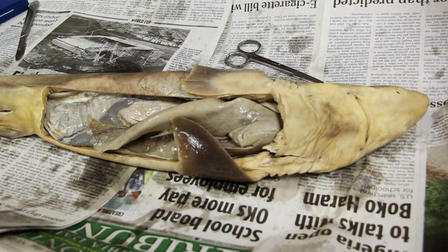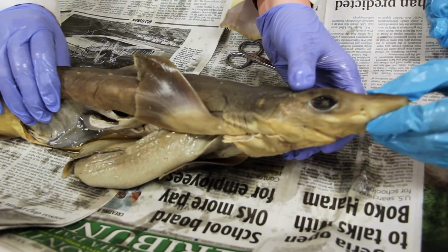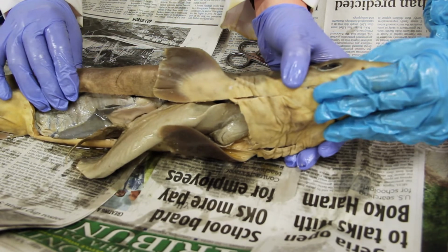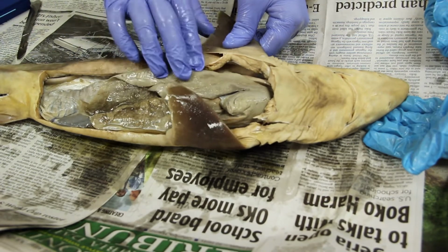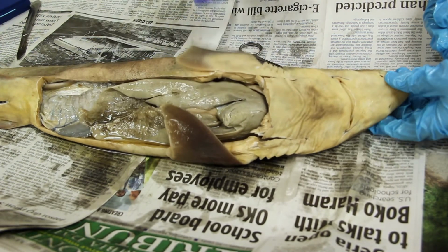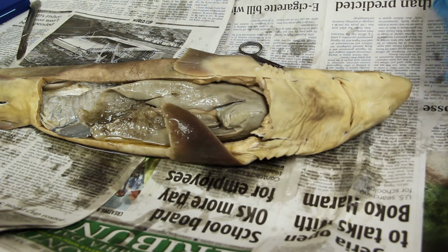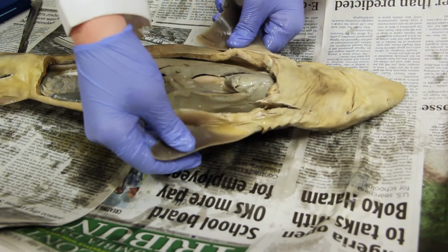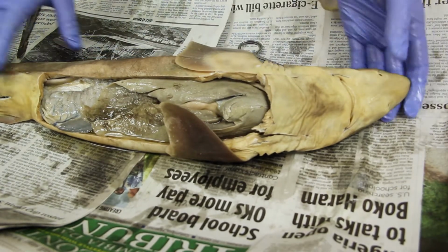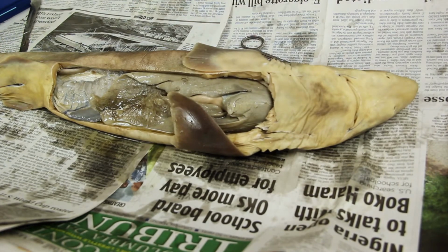And then next is the optic lobes, which are connected to its eyes, and it's self-explanatory how it helps them see in the water. Sharks don't have the greatest sight, they see better in brighter lights, which kind of doesn't make sense because most of the time they're in dark areas of the sea. And then the cerebellum is caudal from the optic lobes, and it controls muscle coordination. So that would be controlling his fins or his tail, just the way that he moves in the water.